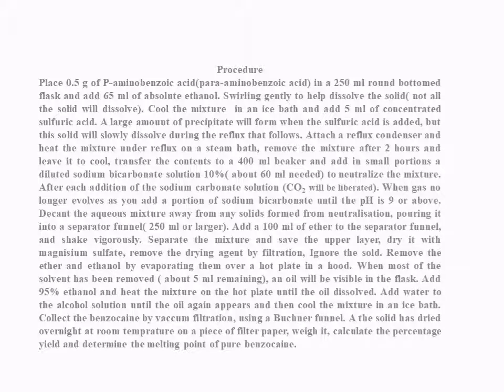The reaction is exothermic and we need to cool the mixture in an ice bath and add 5 ml of concentrated sulfuric acid. A large amount of precipitate will form when the sulfuric acid is added, but this solid will slowly dissolve during the reflux that follows.